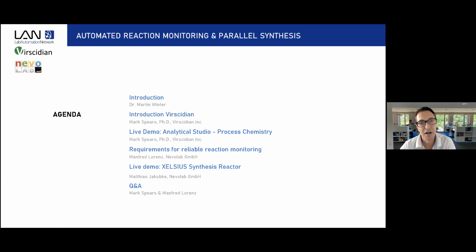Then Mark will give you a live demo and show how Analytical Studio is able to perform high throughput reaction monitoring.